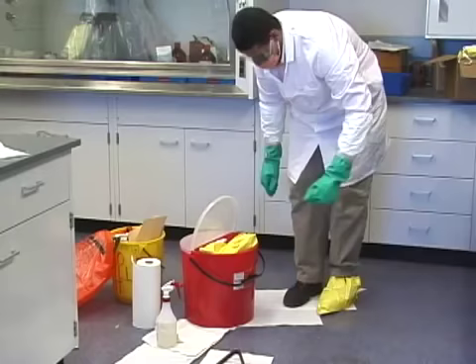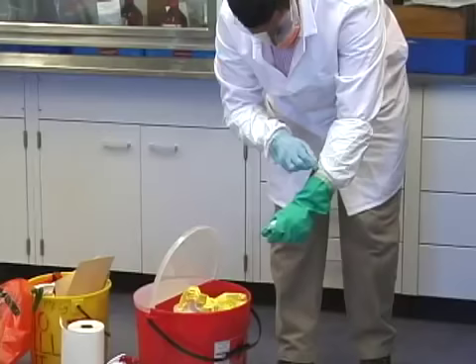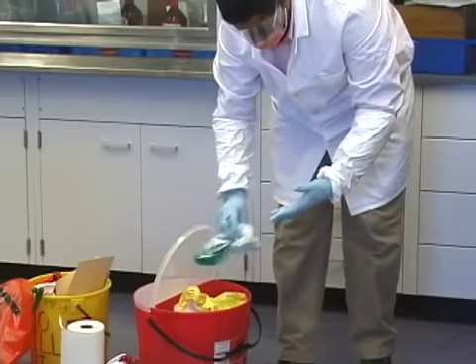When finished, carefully remove your personal protective equipment by removing your shoe covers first, followed by your outer gloves aseptically, then your gown, if worn.